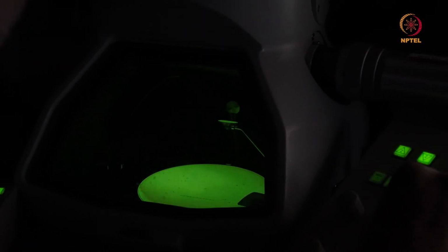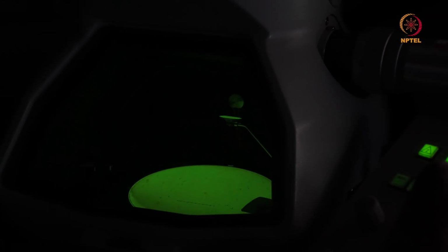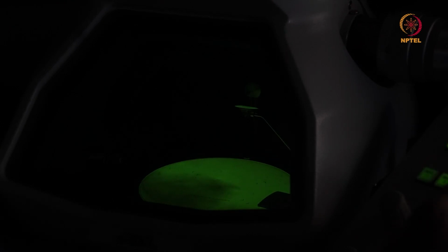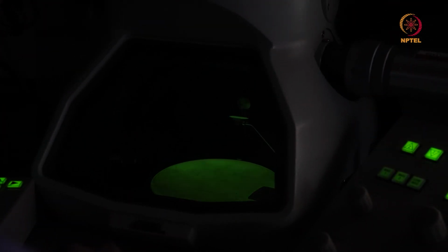Identify a feature of interest. I'll just go to one of the edges of the sample here. This is a metallic sample, an aluminum sample, and I am at a magnification of 40,000x in SA mode, and I click image wobble.